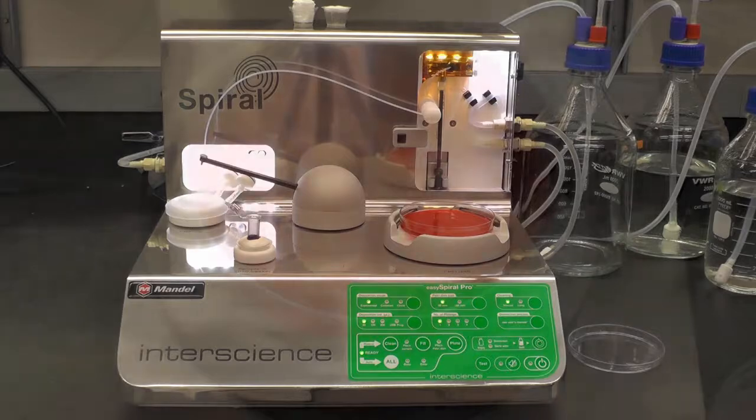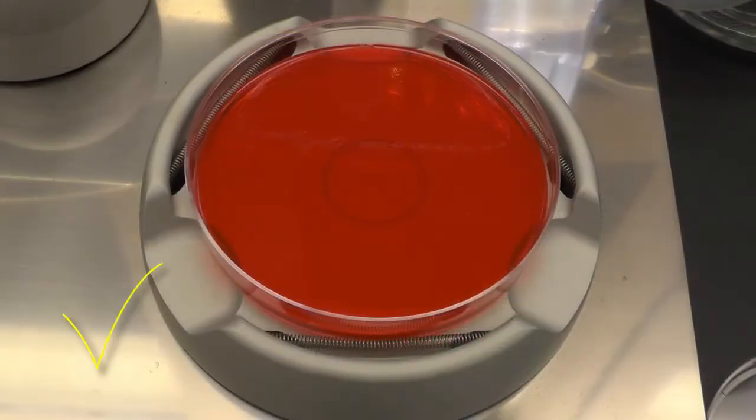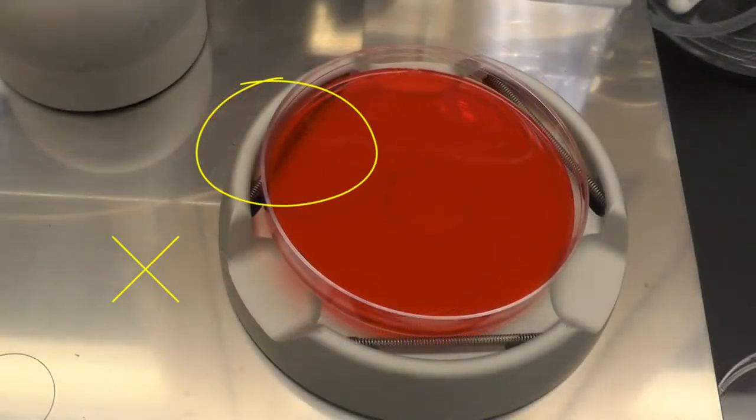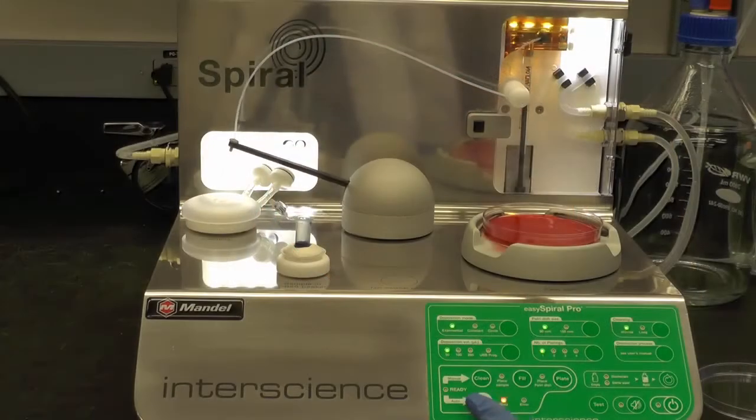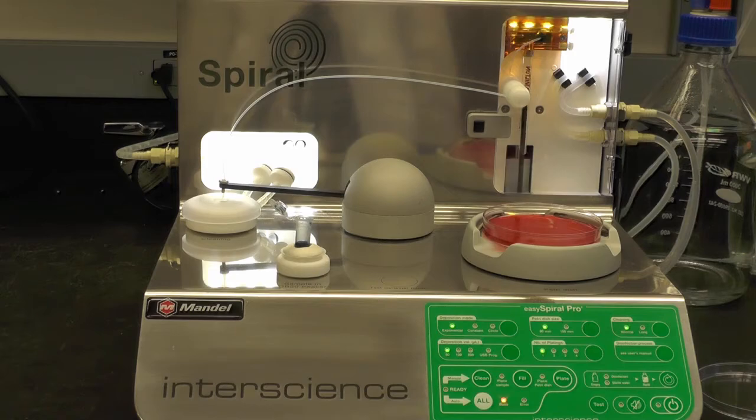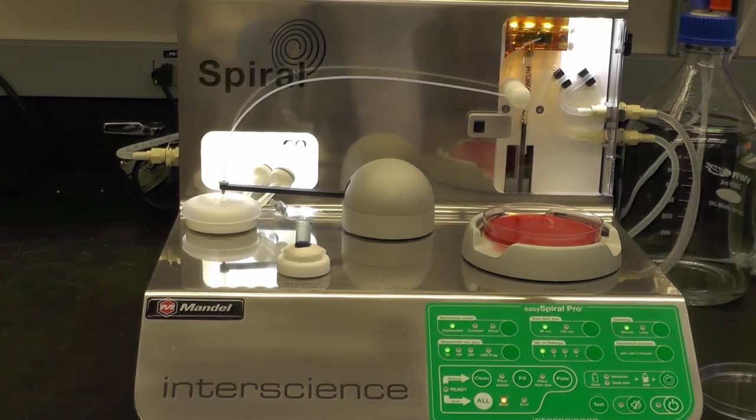Put your plate onto the plate holder and remove the lid. The plate has to be flat and secured by the plate holder. A slanted plate will cause inaccurate plating. Then press the ALL button and the cleaning, filling, plating process will start automatically.